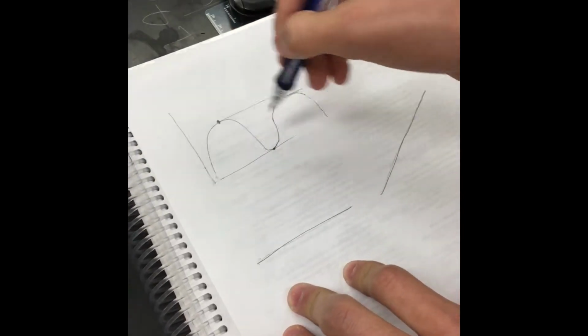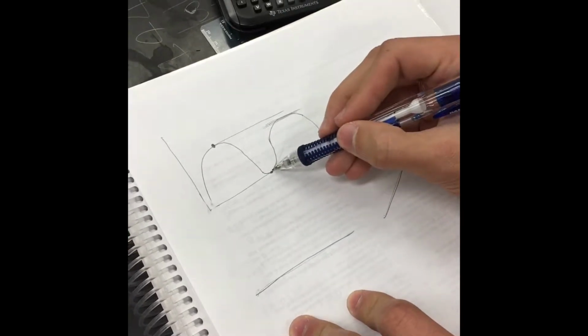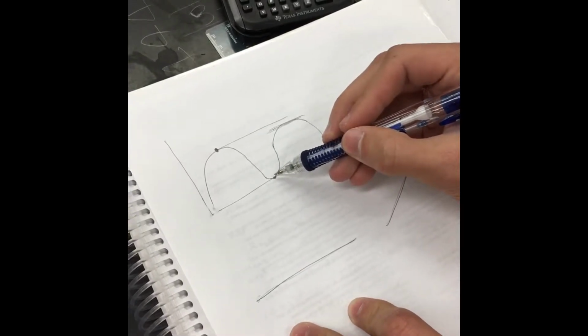The reason why we pick lambda max is because it's going to give us the most clear-cut difference between the absorbance of different concentrations of whatever we're measuring. So say we picked this point, which is the absorbance for the stock solution at this point is close to, if not 0.